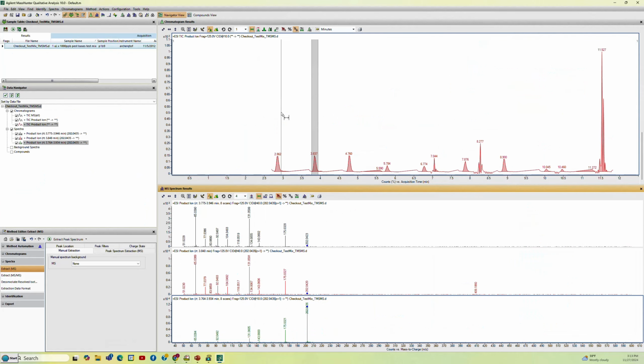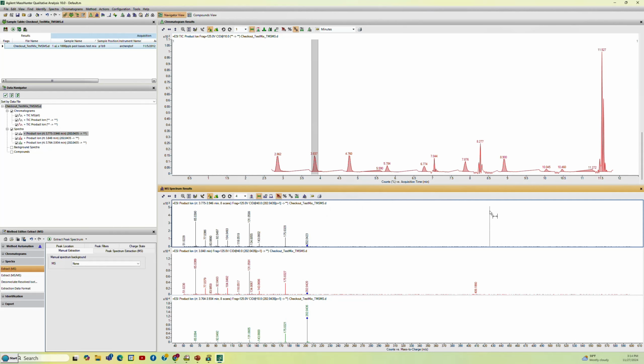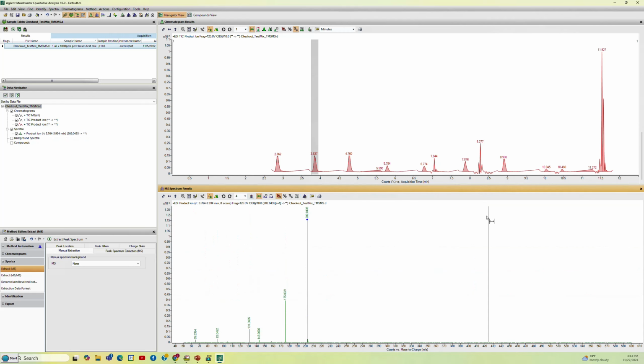So that's pretty much how you select different energies. And like I said, you can do all three of them, plot them all, and then scroll between them to get the spectra that you can send to the bottom. To clean up some of this stuff at the bottom, I usually left click in the top one, and then I use the delete key on the keyboard and clean up some of them just by going to the next spectrum and hitting delete. So that just kind of cleans up some of our workspace.